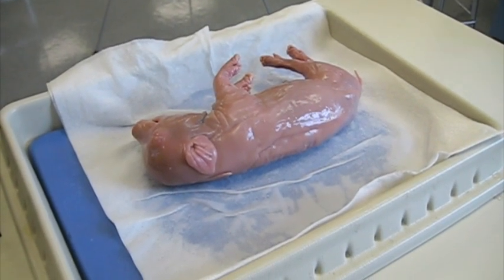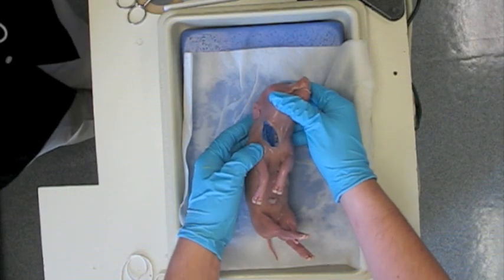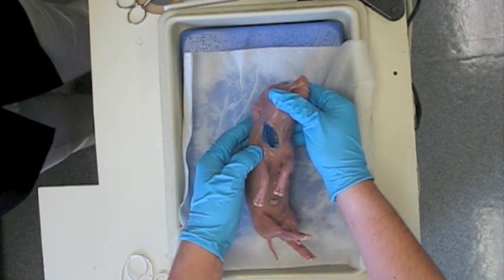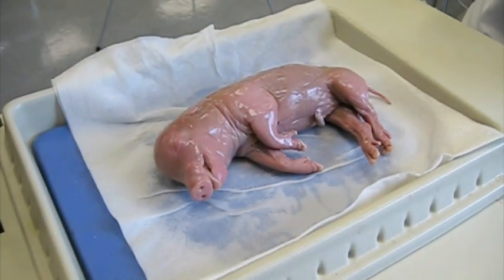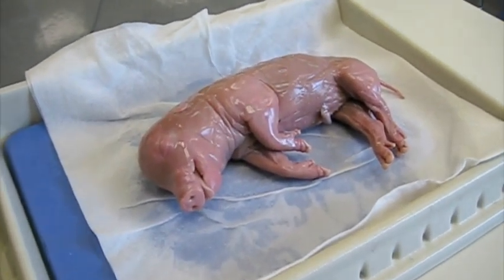Now that we have gotten our tray ready, we can start examining the pig. What you will likely notice first is a large cut that is stained blue. These animals are specially treated with preservative chemicals and dyes to outline the arteries and veins. Arteries are stained red and veins are stained blue. The opening is where they inject these chemicals. Let's take a look at some more external features.